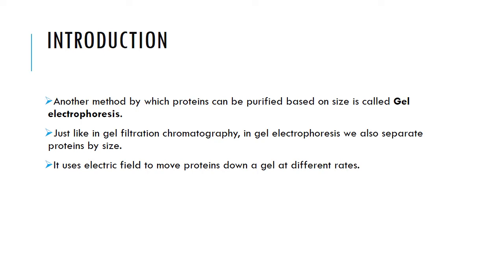Basically we are dealing with separation or purifying of proteins, but now we are focusing on their sizes. Another method we can use is gel filtration chromatography. But when it comes to gel electrophoresis, our main focus is using an electric field.